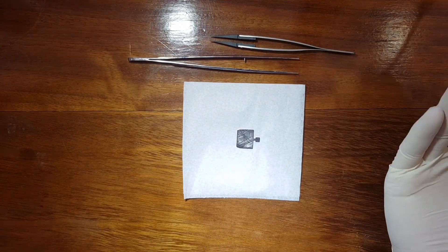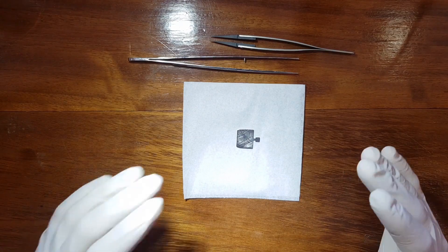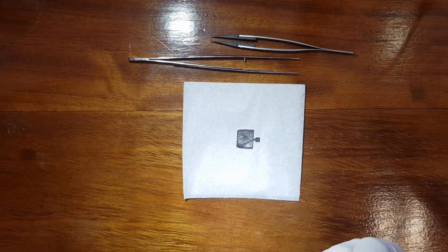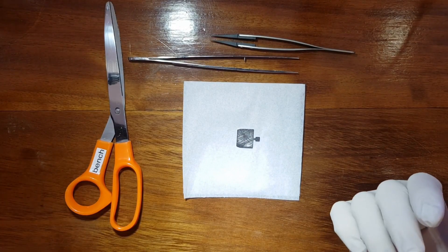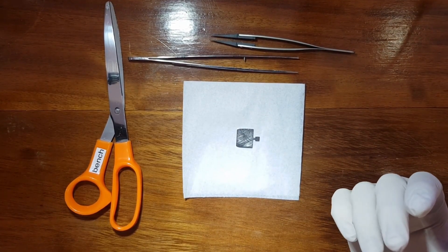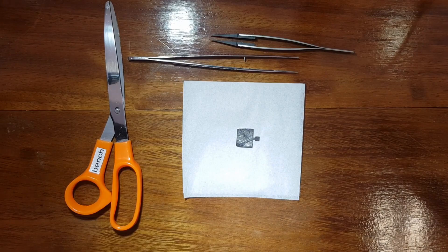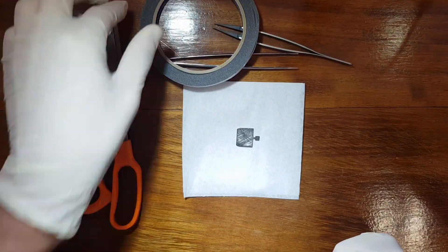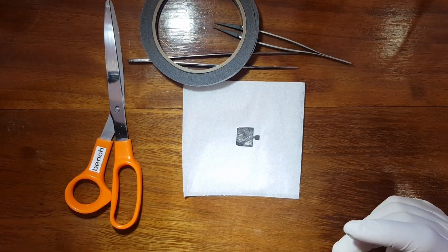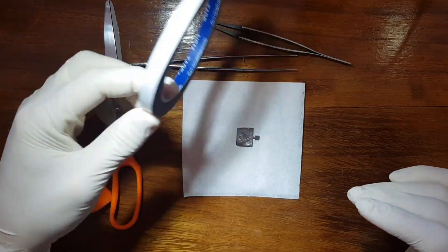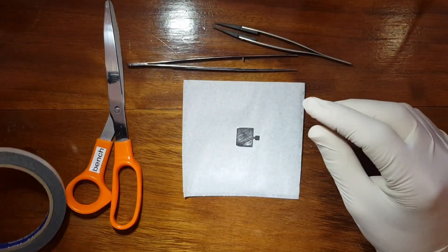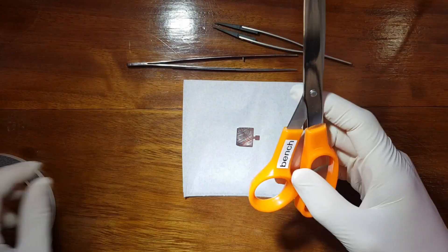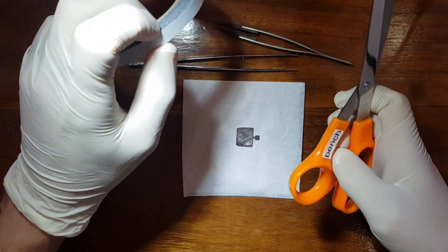Before we can do that we have to prep the samples, which is the core of this video. Extra tools we'll need are a scissor and the most important part, carbon tape. You know, the kind of thing you find in the kitchen sink cupboard.